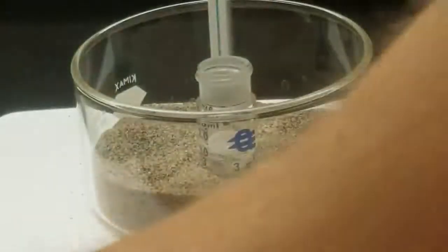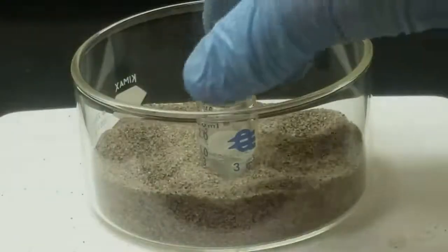All right, so we'll call this dry enough for the first run. We'll go ahead and take this out. You can see all that remains is this kind of white solid in here, which is our material. And so we'll go ahead and weigh this and then break it up a little bit and then reweigh it.